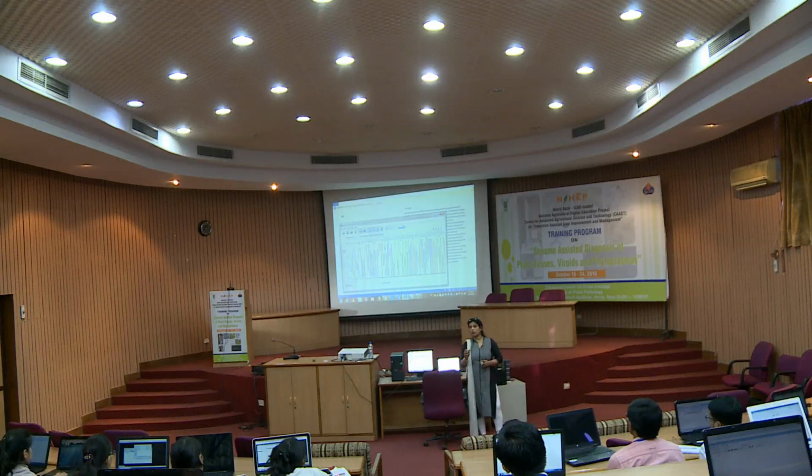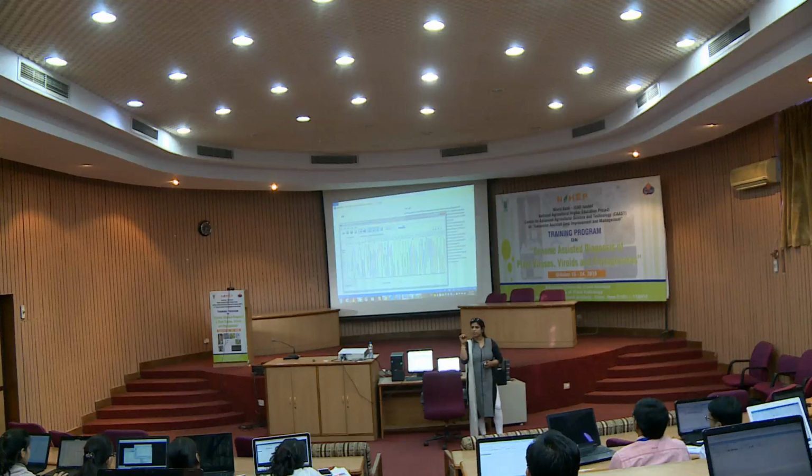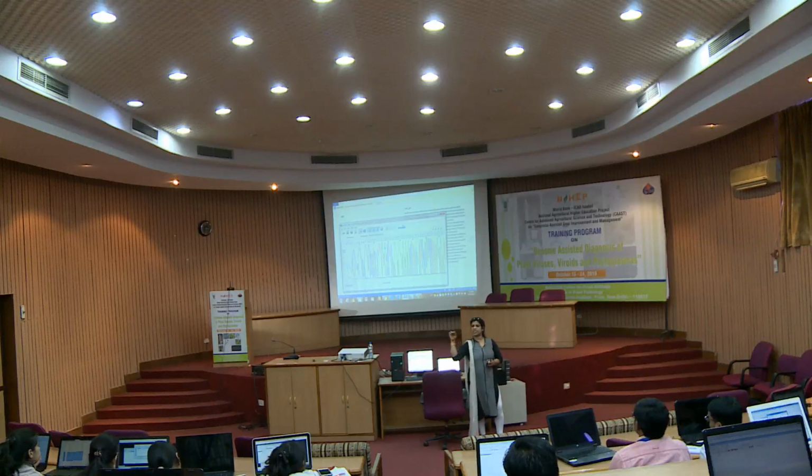But I want to confirm whether it is C or A. The contig will also give some base, whether C or A. But whether I have to go with that or not, I have to go back to my chromatogram file and check that particular base. If the quality value of that base is more than 20 or 25, then I can go with it; otherwise, let's suppose it has misread that C as A in the reverse sequence.